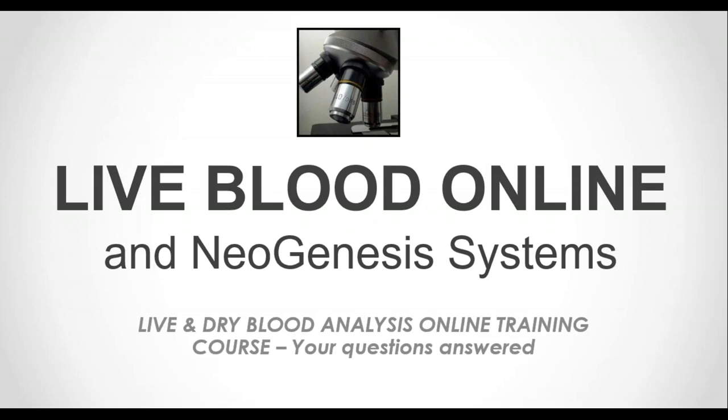Okay, thanks. And the lighting is very important to be able to see all of the anomalies in dark field as well, is that right? Yeah, absolutely. So as I mentioned, it needs to be at least a 50 watt halogen light source. And that in itself is fairly rare. Most of the microscopes don't have that type of feature.